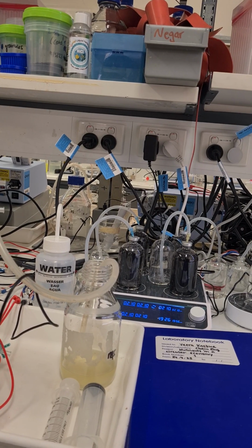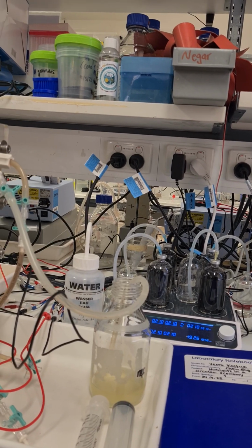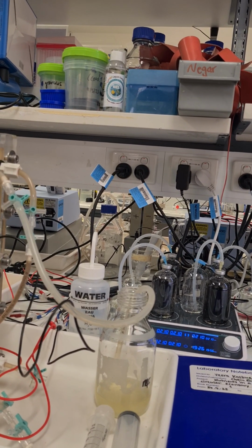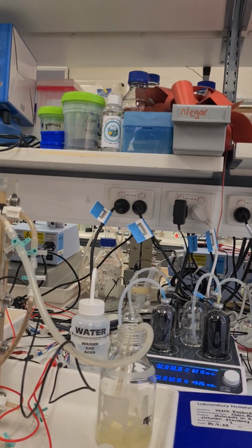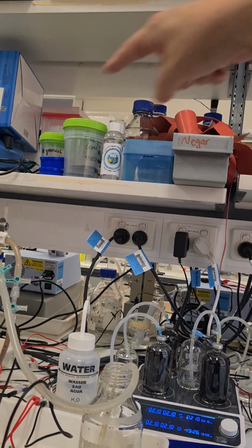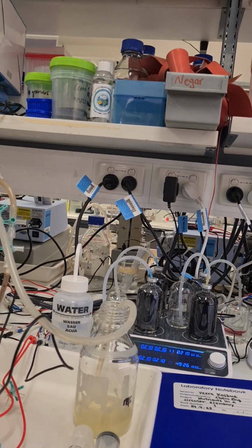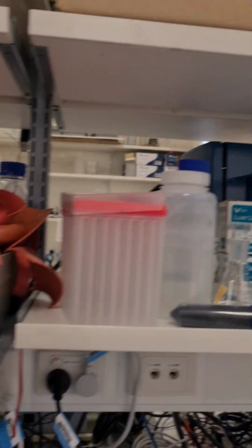I'm currently controlling the anode potential to provide suitable conditions for the microbes because they like a specific potential range. This is the potentiostat, and all three of them are connected. Yes, correct. I'm applying a potential, and then that will record the current.